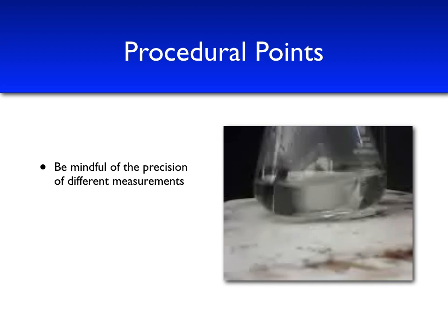Therefore, when you're doing your calculations, it's very important that your molar mass have at least 4 sig figs, so you do not limit the precision of your calculations. And as always, you should carry sig figs through your calculations based on the numbers that you start with.